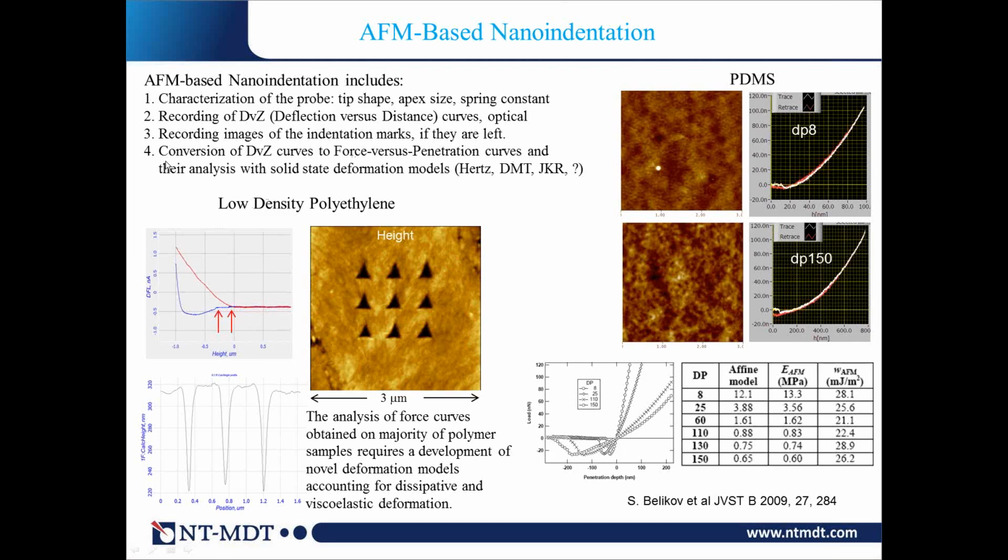Then you need also, from these curves, to convert to the force versus penetration curves through the optical sensitivity calibration. And then, when you have done all this, you need to choose the appropriate model for extracting the mechanical and adhesive data. These are examples I will show you, done on low density polyethylene.